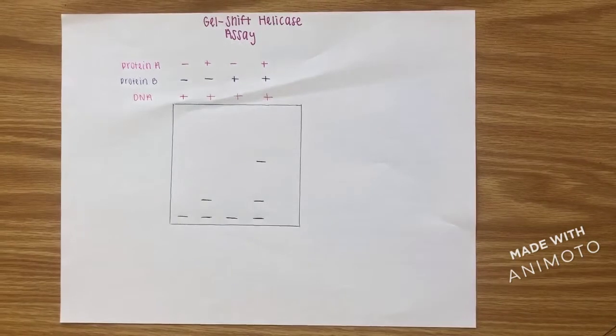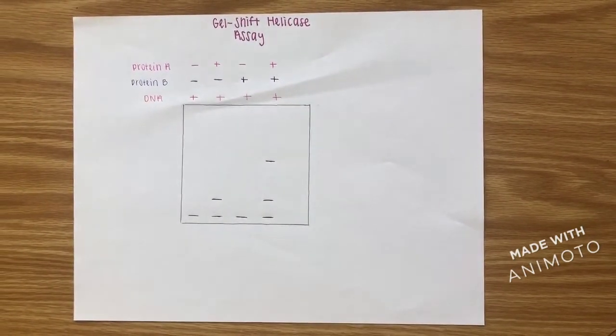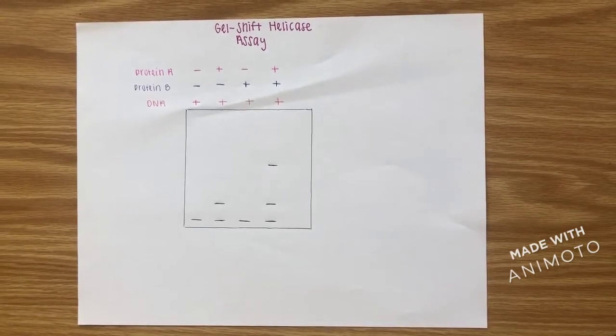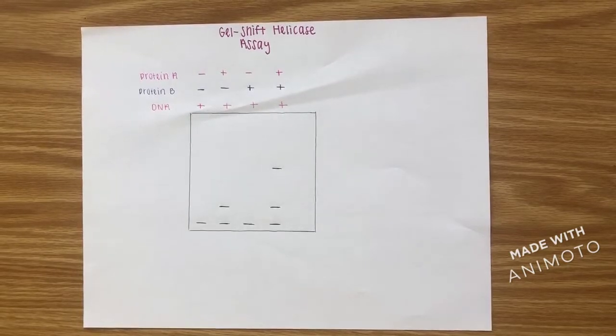The second example is a little harder. There are 4 wells this time. The first well has just DNA. The second well has DNA and protein A. The third well has DNA and protein B. The fourth well has DNA, protein A, and protein B.